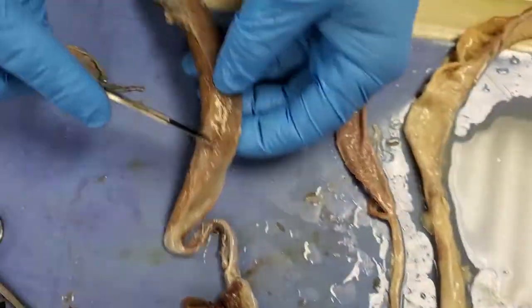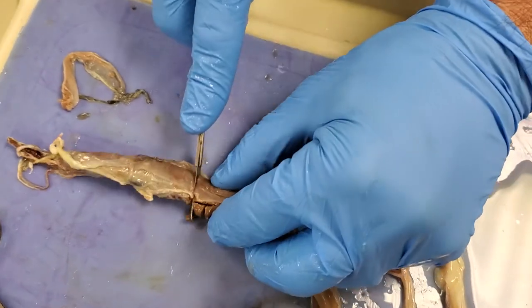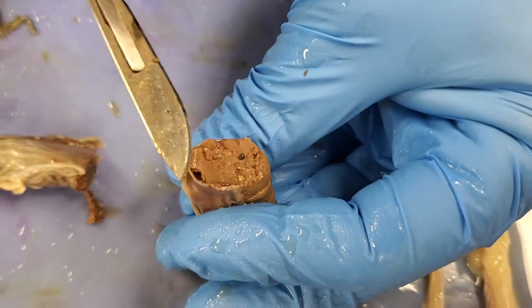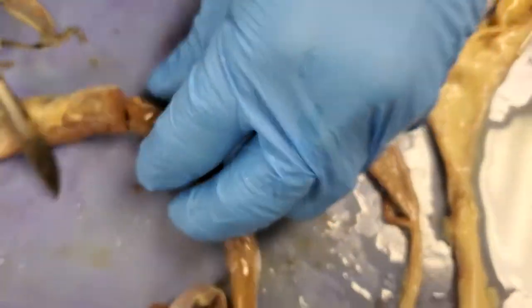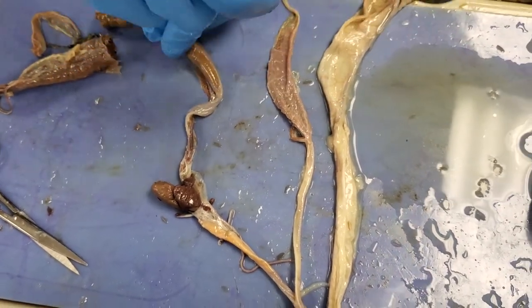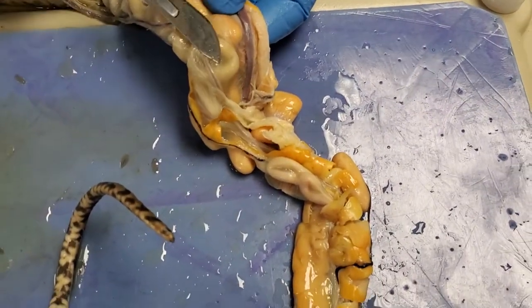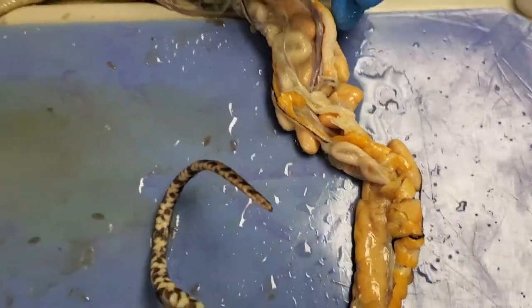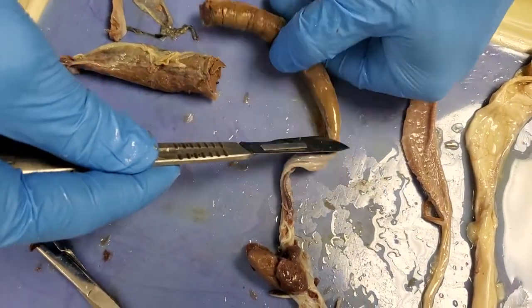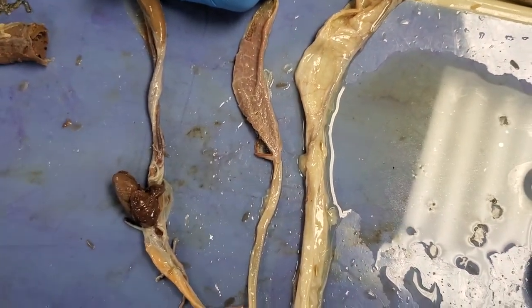This is the liver — this large thing right here. And if I cut right through it, you can see that this is not a hollow organ. The liver is solid through and through — a very thick glandular organ. And the liver looks like it's connected up to the heart because after food nutrition is absorbed by the intestines over here, it goes into the bloodstream, and the blood brings it up through the liver for processing before the blood returns back to the heart to be pumped through the lungs to get oxygen and then out to the brain and the rest of the body.